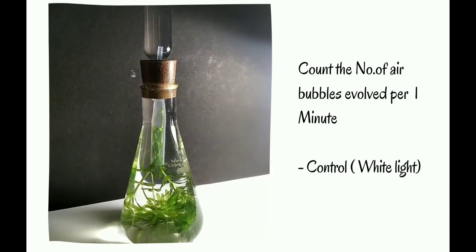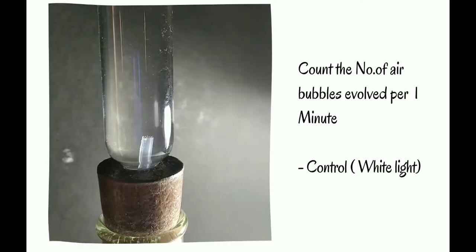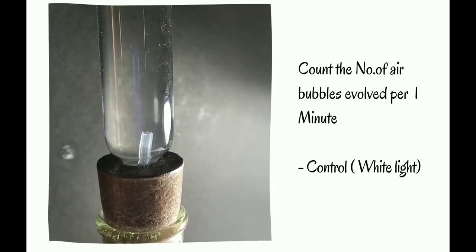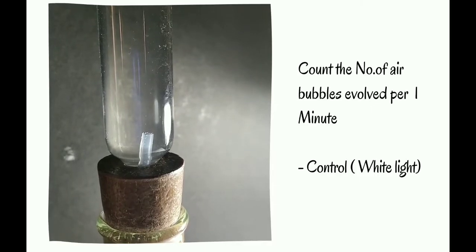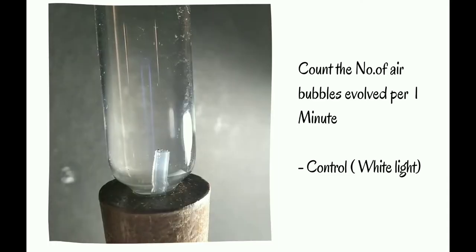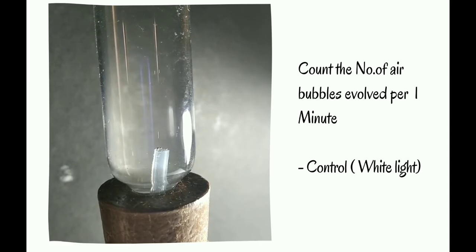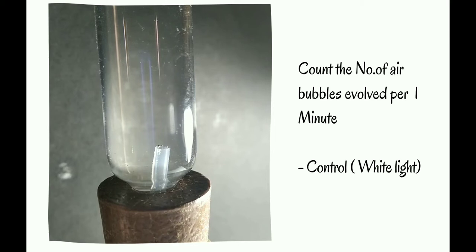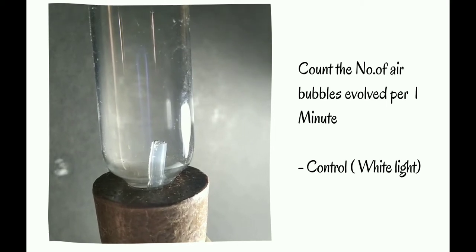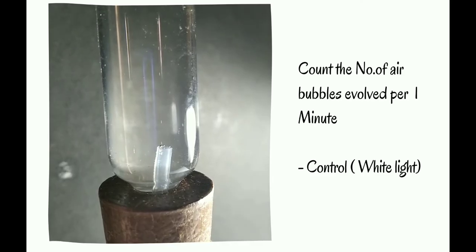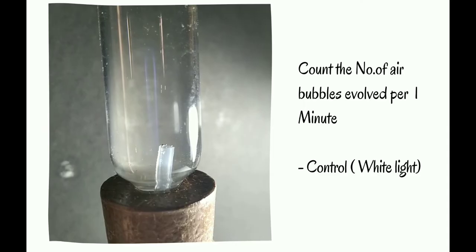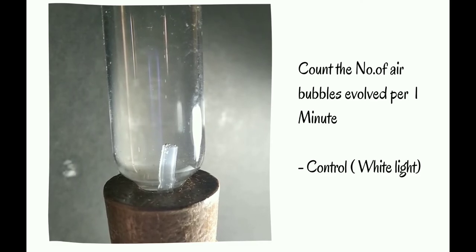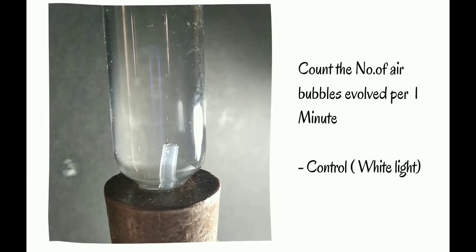We count the number of air bubble formation for the control, which is white light source. Count the number of air bubbles evolved per 1 minute of time interval. Comment your answer in the comment session for the number of air bubbles evolved per 1 minute.